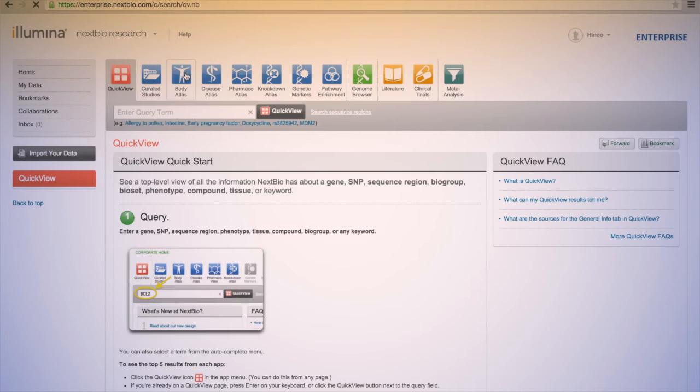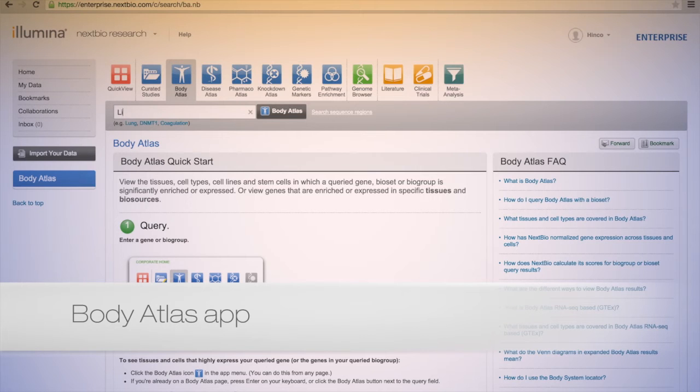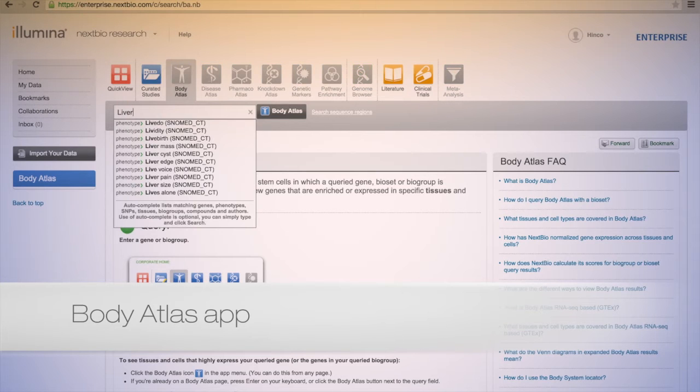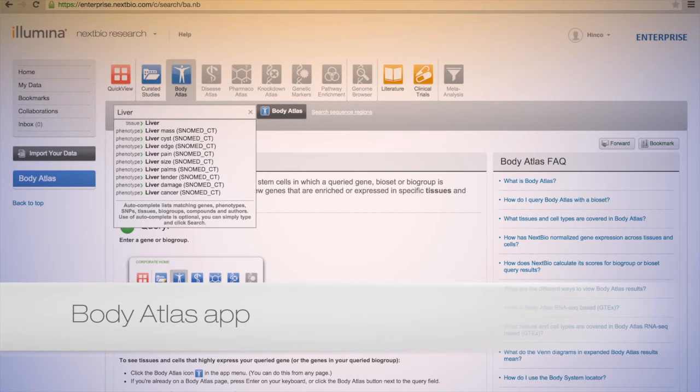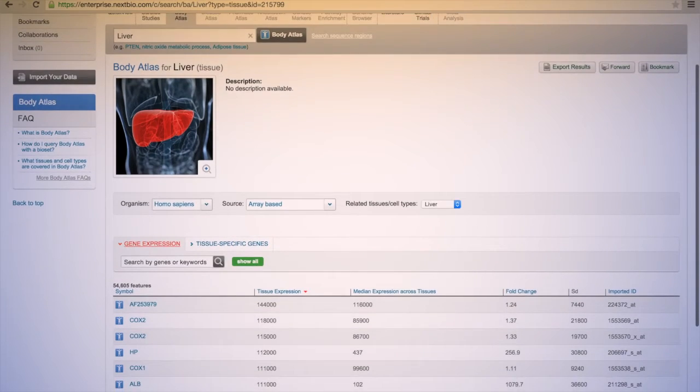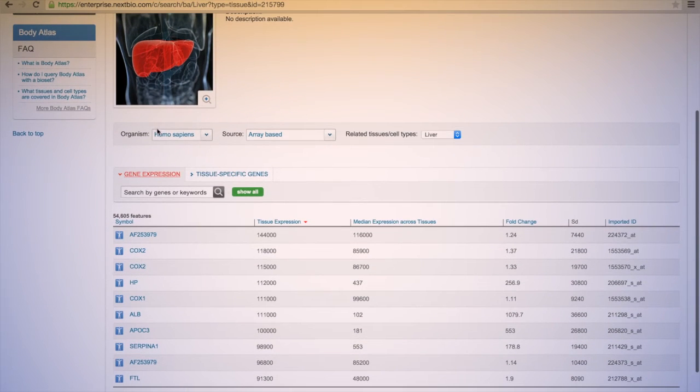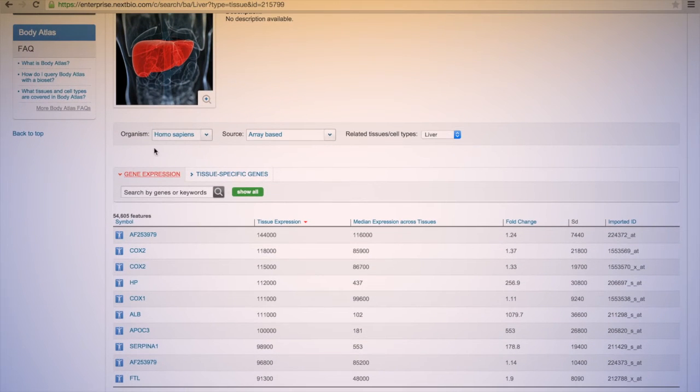Use the Body Atlas tool to find normalized gene expressions across all tissues, cell types, cell lines, and stem cells. Sort your results by absolute gene expression or body system. Identify uncharacterized gene expressions, biogroups, and biosets.